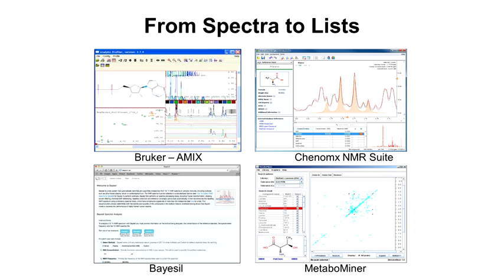It has information about the structures of those compounds. Another very commonly used tool is the Chenomx NMR Suite, which actually appeared many years before AMIX, and generally is a lot easier to use. It allows you to perform spectral deconvolution. Requires a bit of experience and training. The software can be downloaded for free, and many people actually use the free version.